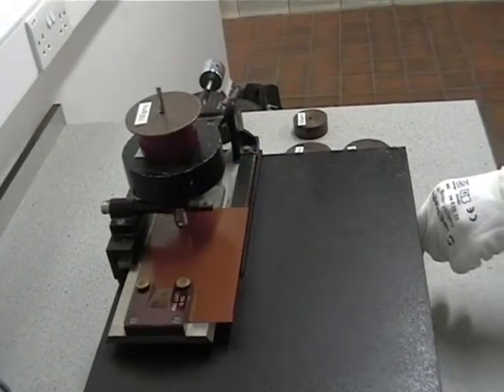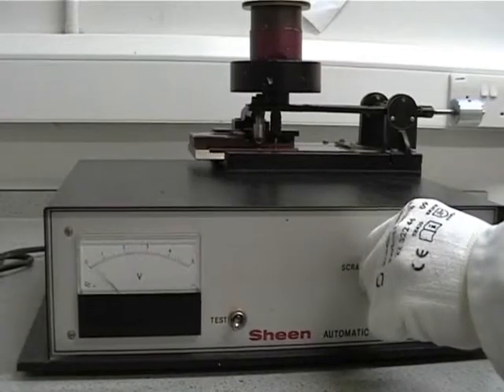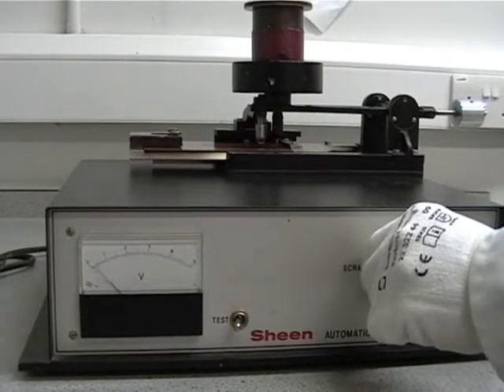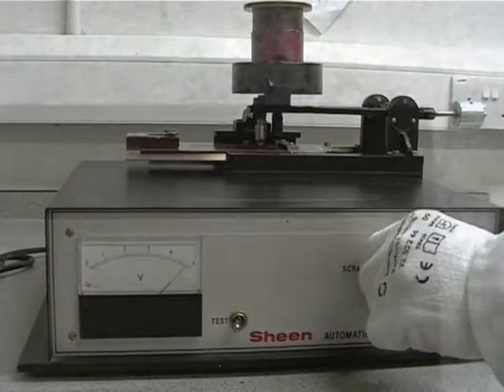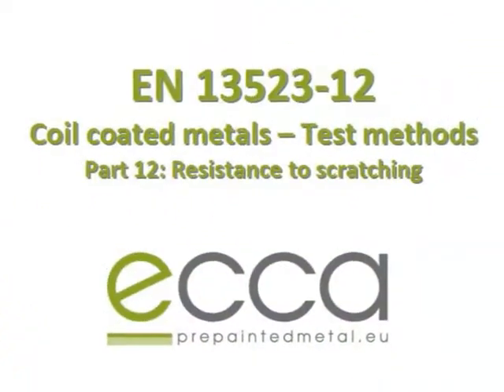The test is often used as a pass-fail test, but is also used in the specification of pre-painted metal, in which case the quoted result is the largest weight which can be applied without penetrating right through the paint layer.